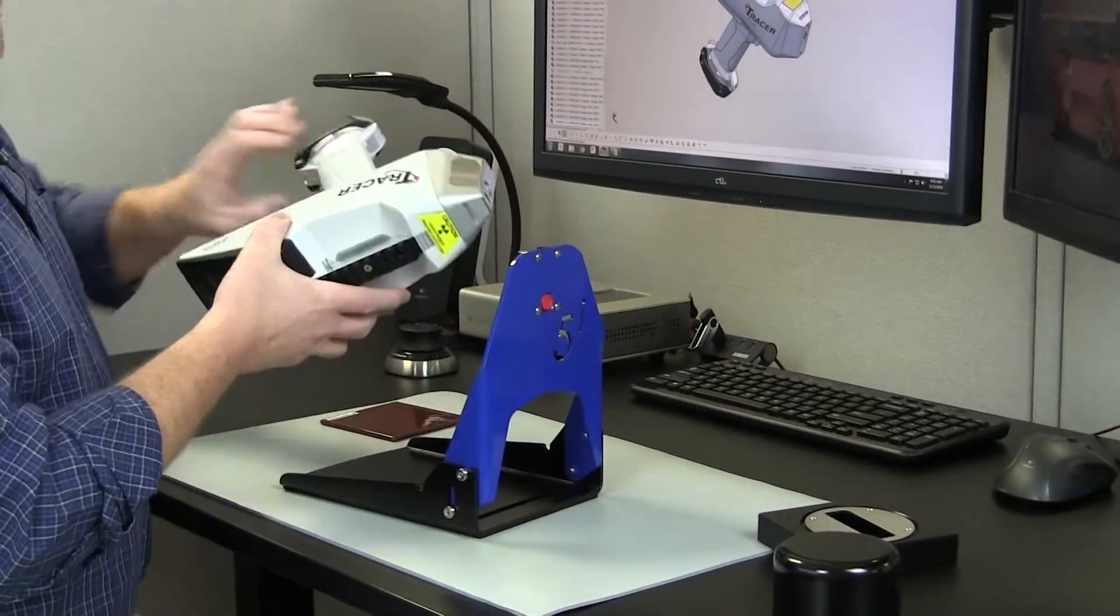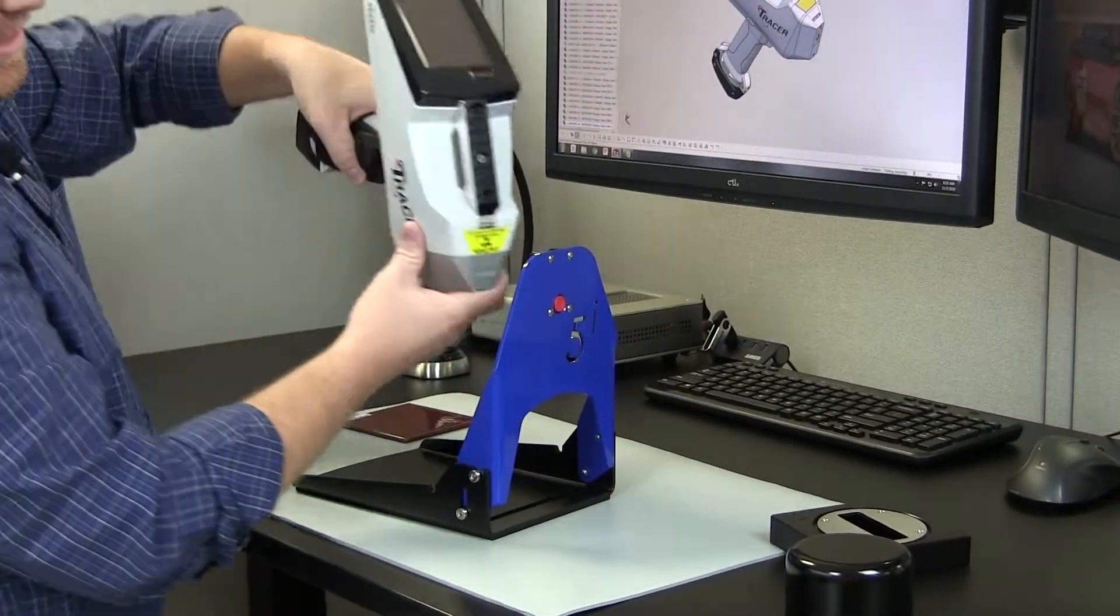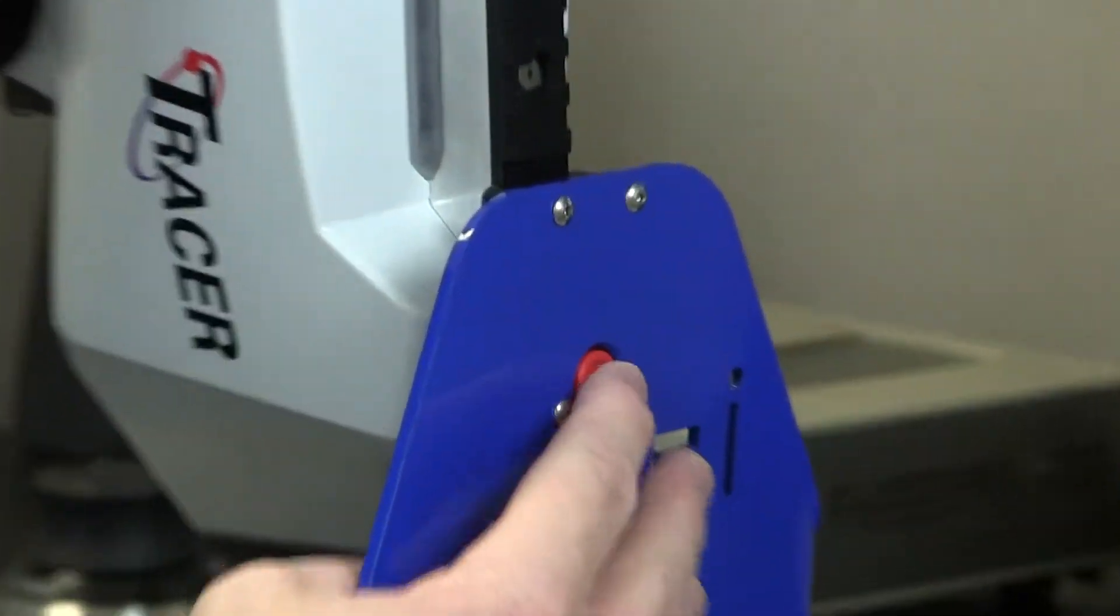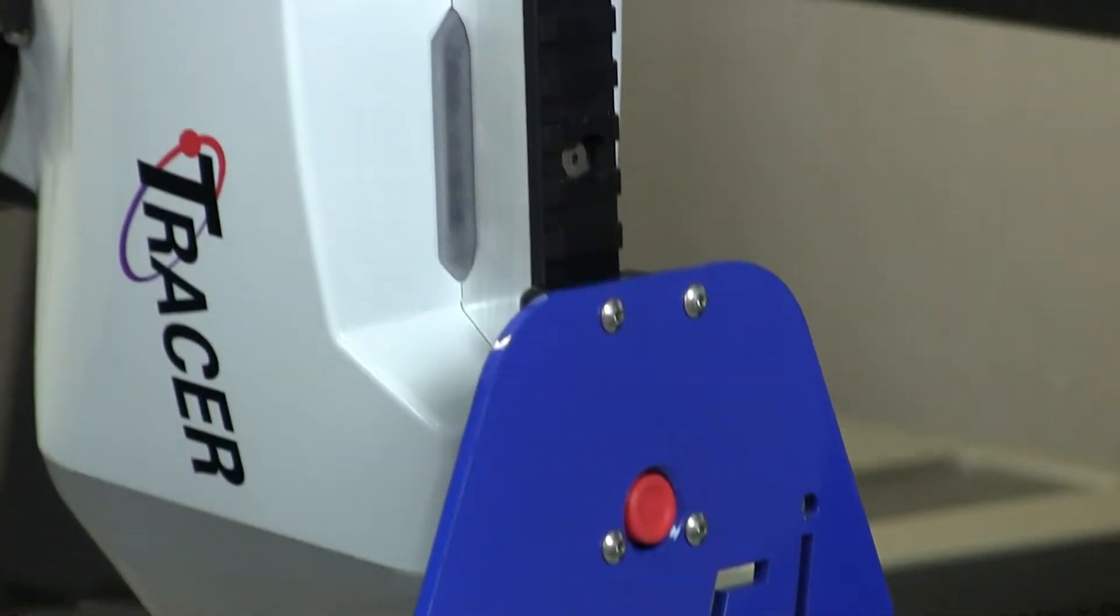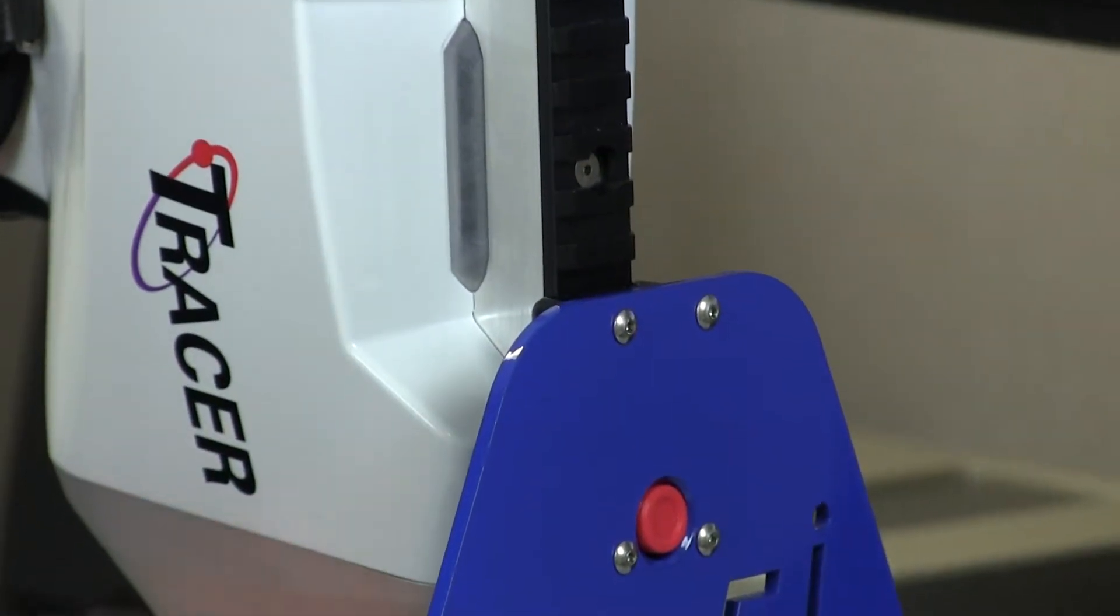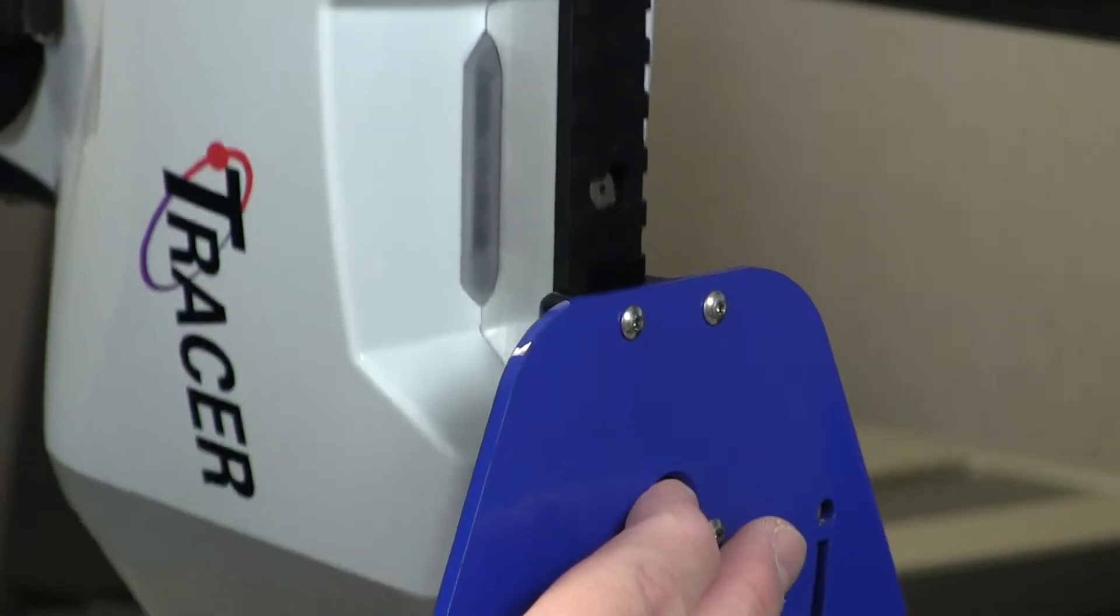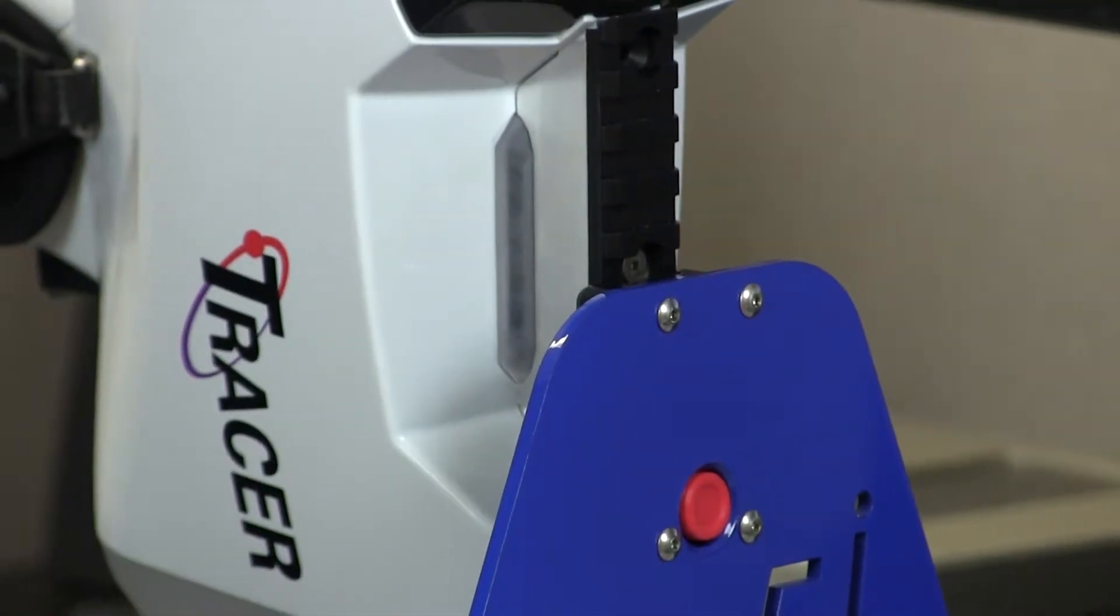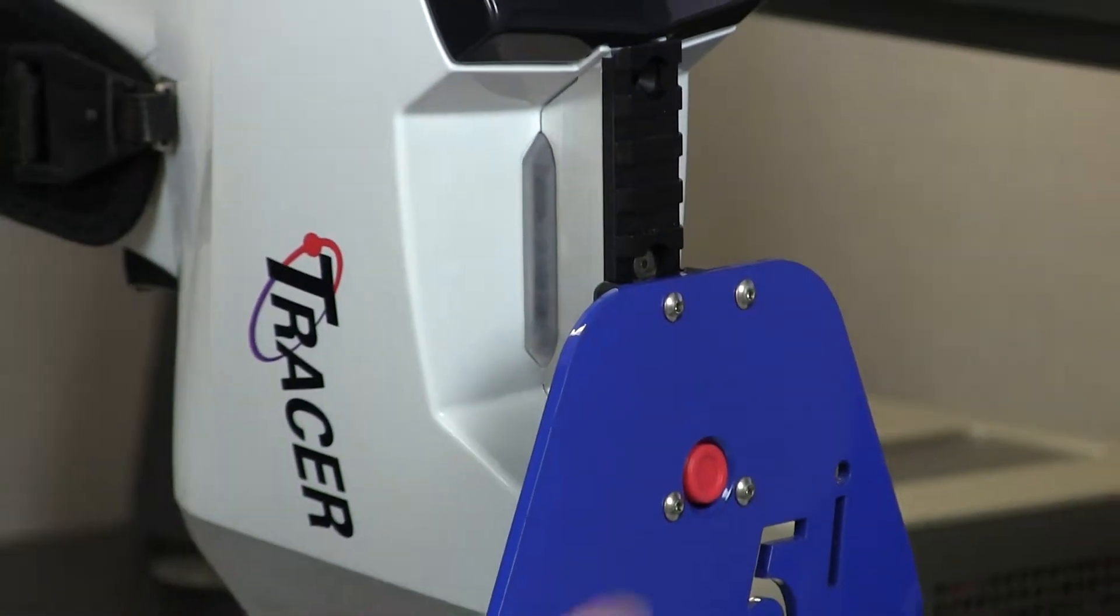Nose down position is the same way. This time you have multiple positions - it'll lock into that first spot and depending on what you're putting underneath it, you have multiple positions that you can set the height at.